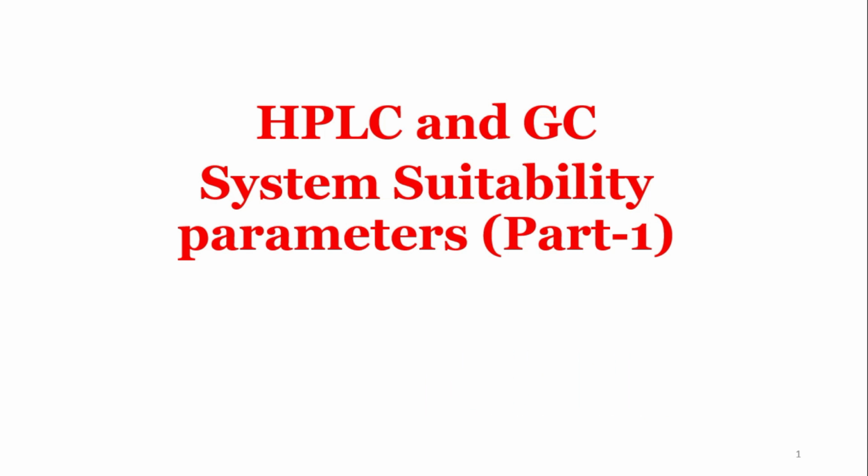So today we will look into one of the most important interview series questions and answers which is asked in the pharmaceutical interview, whether you are fresher or whether you are experienced. These questions will definitely be asked in a QC department or in a R&D department or whichever department you go. This is one of the basic questions asked in the pharmaceutical interview question and answers. So we'll see HPLC and GC system suitability parameters part 1.